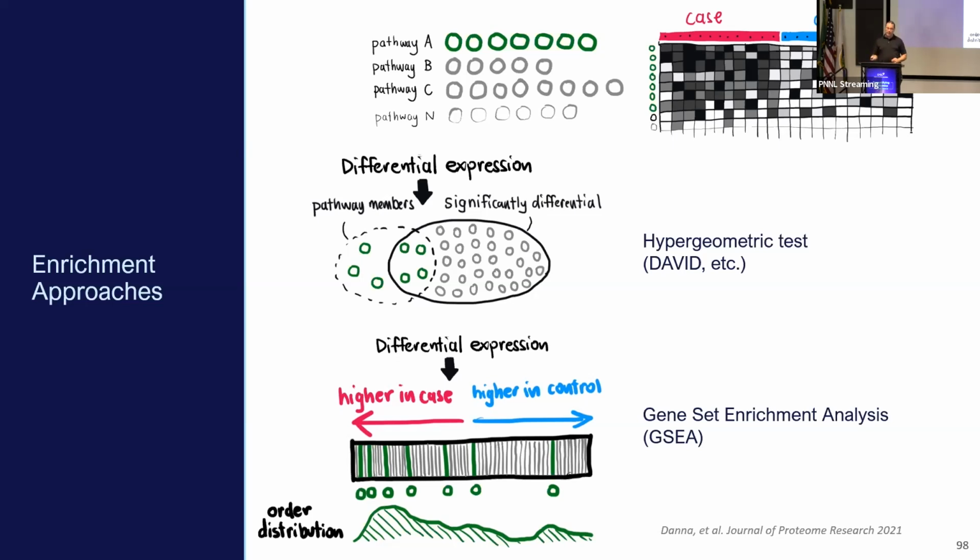You will get a p-value out of the other side, and you also get something GSEA calls an enrichment score, or a normalized enrichment score, so you'll see that as well. And that basically gives you an indication of how far from the middle of the list you are. Are you way on this side? Are you way on that side? And it kind of correlates with the p-value.